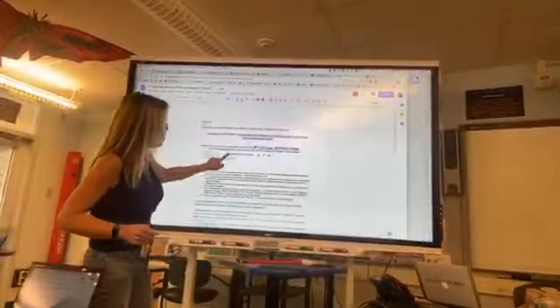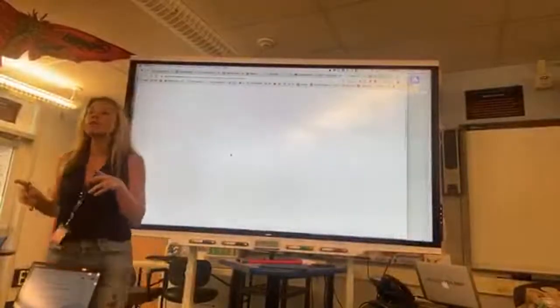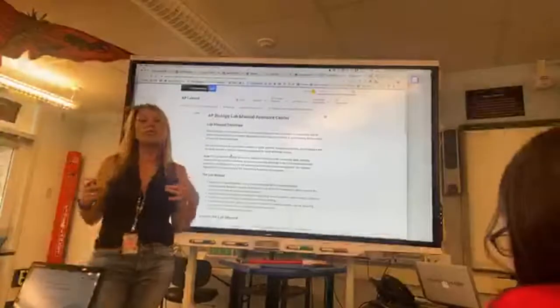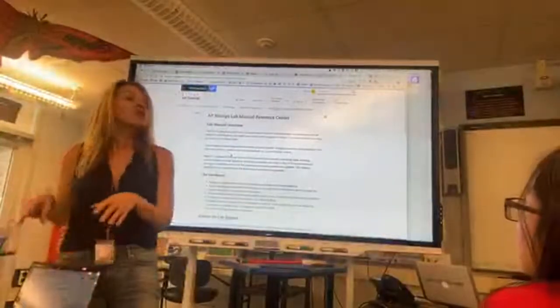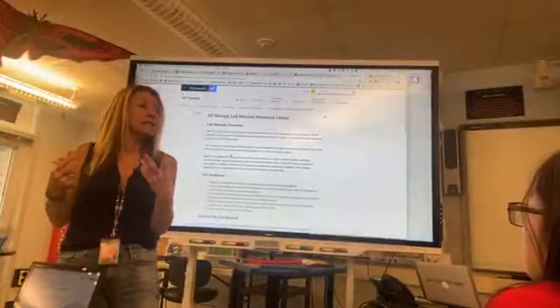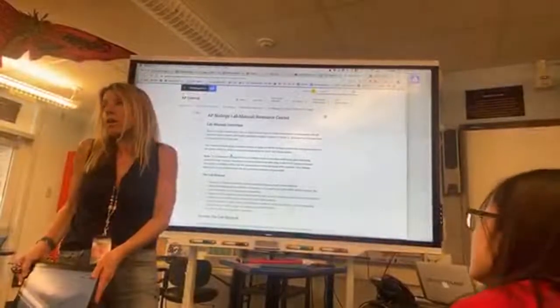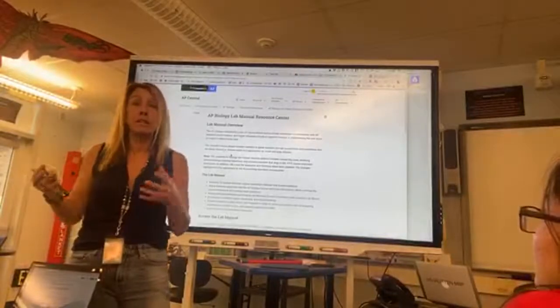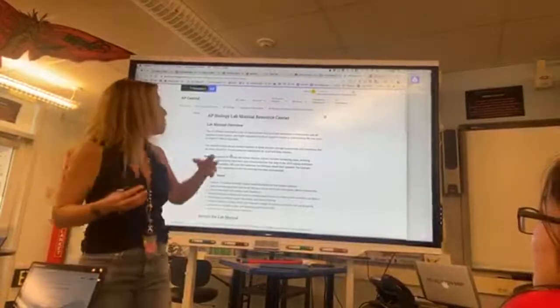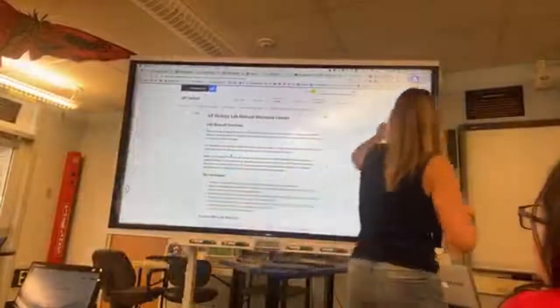I'm going to go to the College Board website because what you're going to need to do is download 4 genes from the College Board website onto your computer. You will not be able to access that data. There's nothing on your Chromebook. There would be nothing on your home computer that could understand that data. It's a lot of data. And so I'll show you where those are.